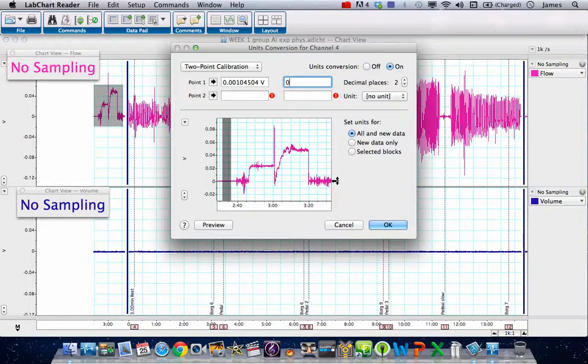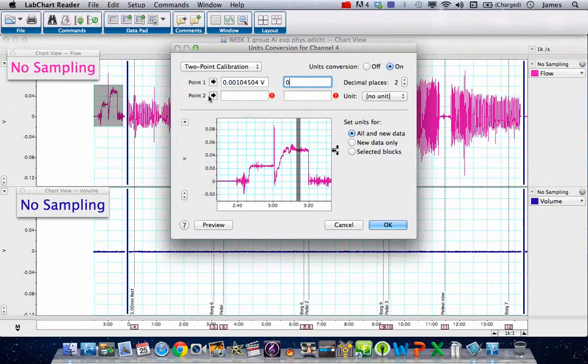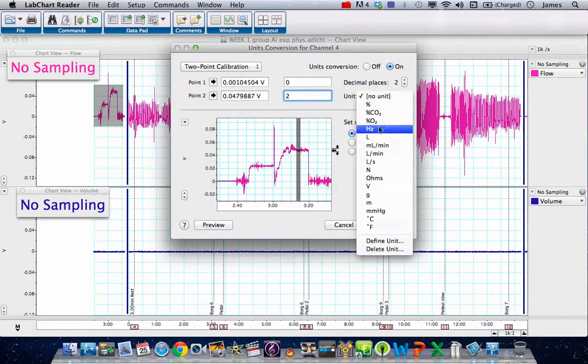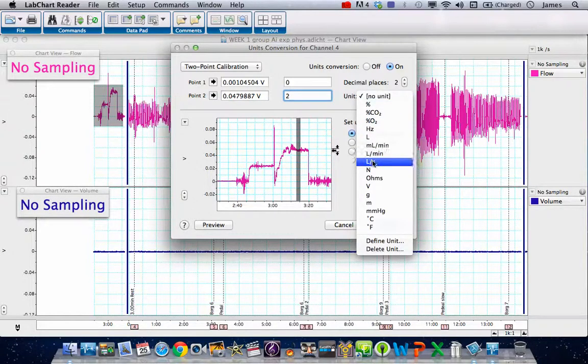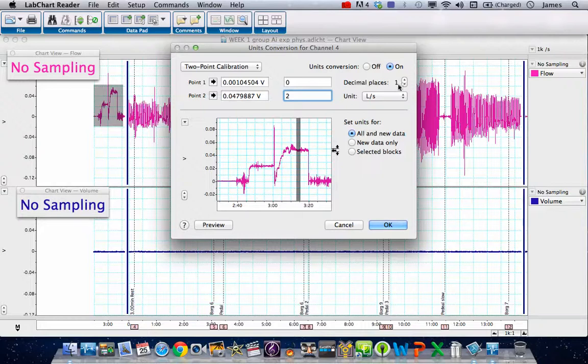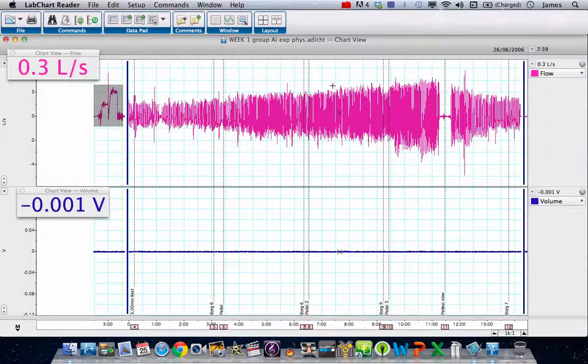Highlight the zero value here. Enter this as point number one as zero. This is going to be our two liters, so highlight a section of the two liters. That is going to be two liters per second, so choose liters per second, and let's put this to one decimal place. Make sure that's correct and press OK.